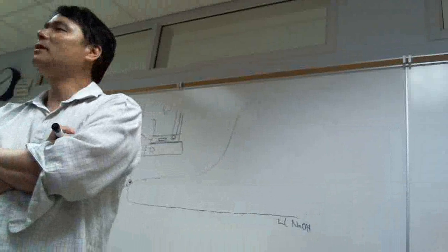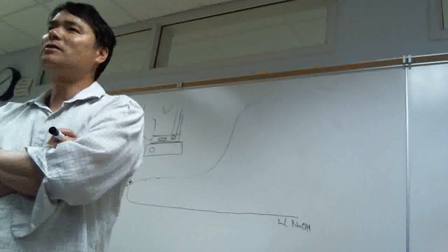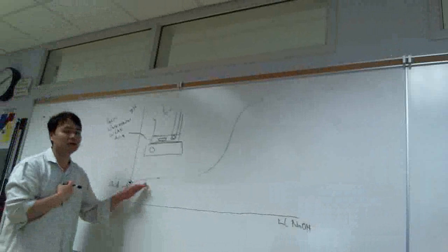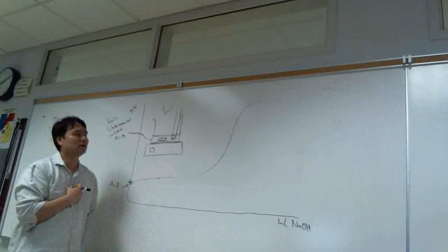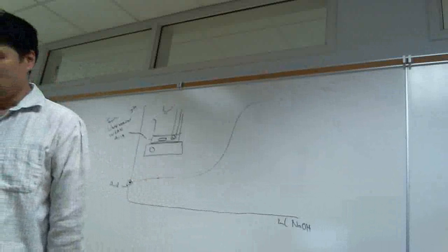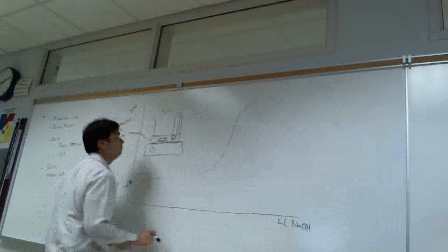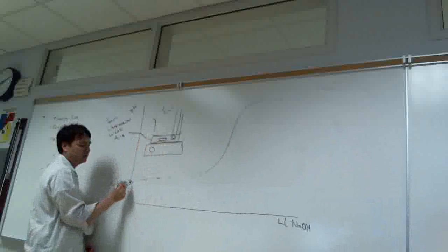Now, there is something called sampling frequency or resolution. High resolution, low resolution. And so what we want to do is get this image of the titration curve, and we want to get as high resolution of an image as possible. That is, we want to see this in high precision with good clarity. In other words, the best thing is to sample this very frequently at very small intervals.